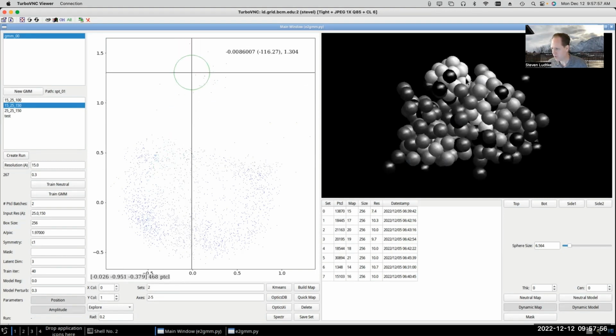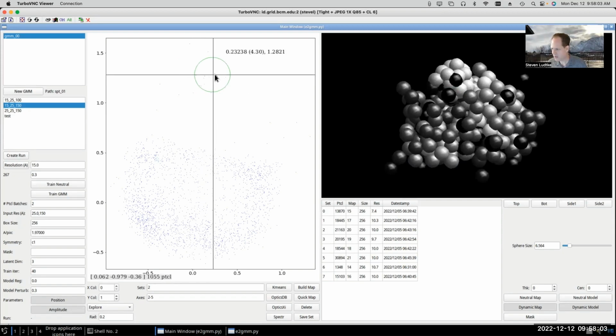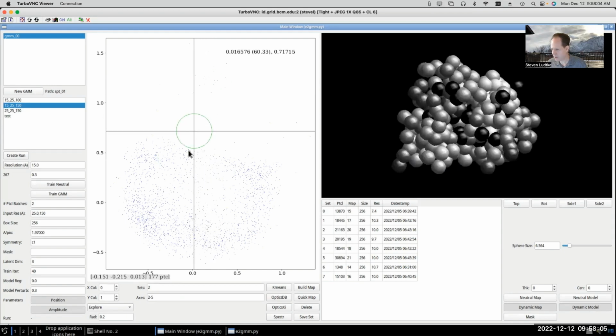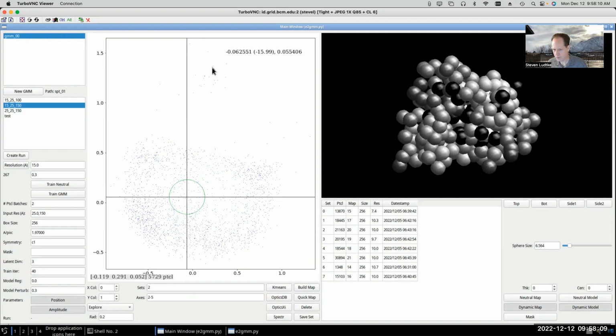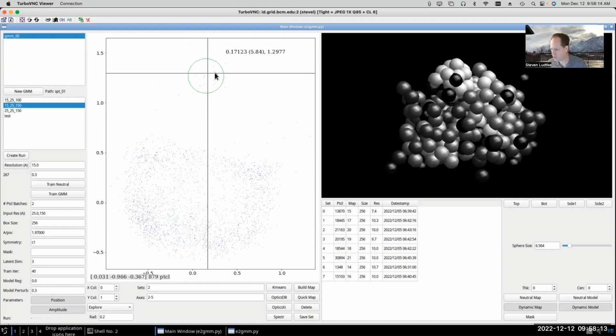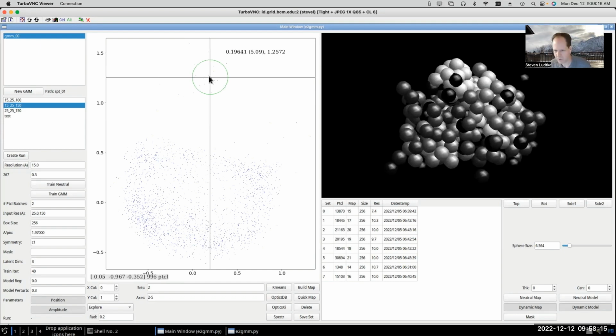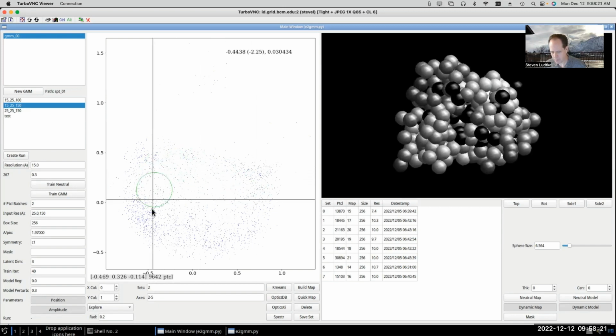You can see this strong intensity change. Now suddenly the intensity down here, these look darker and this looks brighter. So something kind of funny is going on when we get up here. When we come down here, it's actually a very different sort of shape. So this is almost certainly some sort of outliers, particles which shouldn't really have been included in the reconstruction in the first place. Now, how would we figure out what's going on with that in a little bit more detail?